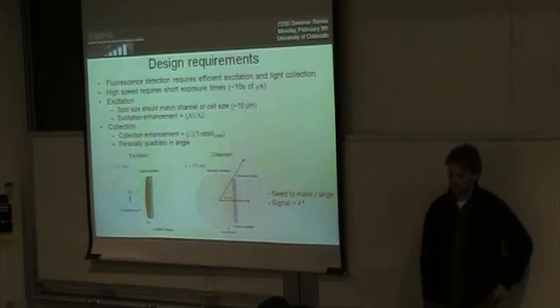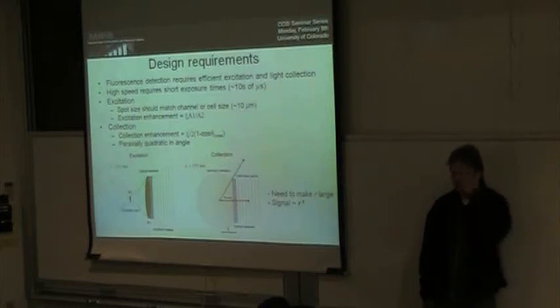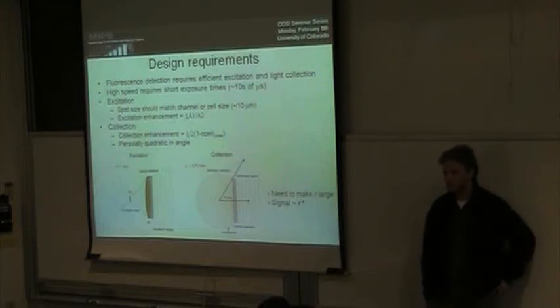When you're designing these microlens arrays, it seems like you generally design one array to match one fluidic channel design, right? Can you reuse the fluidic channels many times, or can you just make your fluidic array and your microlens array, align them once, stick them together, and you're done, or do you have to change that each time you test different species or make new samplers? I think if you just want to load something different in the microfluidics, nothing has to change. You have some system that works.